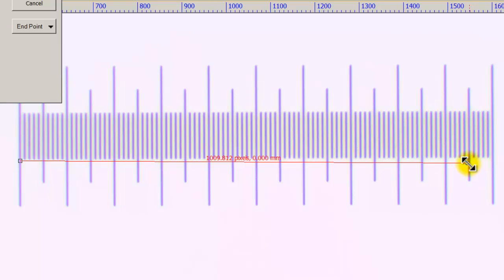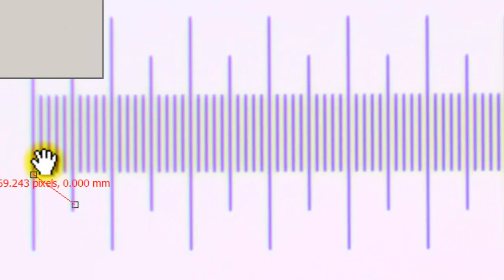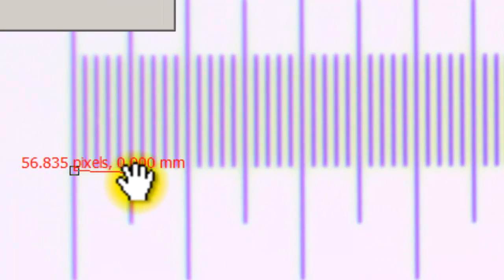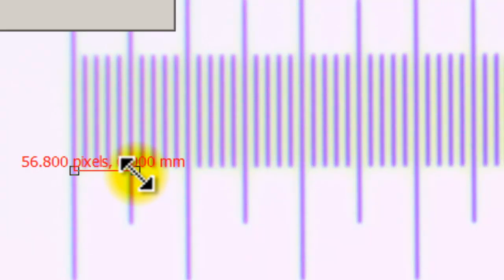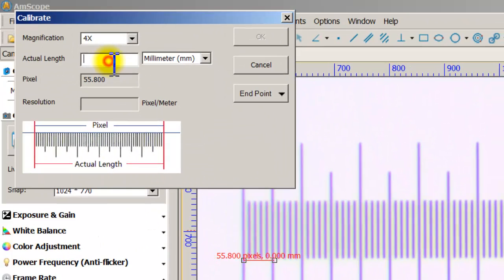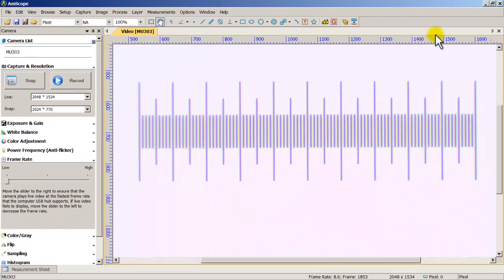I'll grab one end of the red line and drag it. To be accurate, I'll measure a short span — counting lines: 1, 2, 3, 4, 5 — that would be 0.05 millimeters. Make sure the red line is perfectly straight with no breaks. Once it's perfectly straight, I'll type 0.05 in the Actual Length box in millimeters and click OK. That saves the calibration for the 4x objective on this microscope.